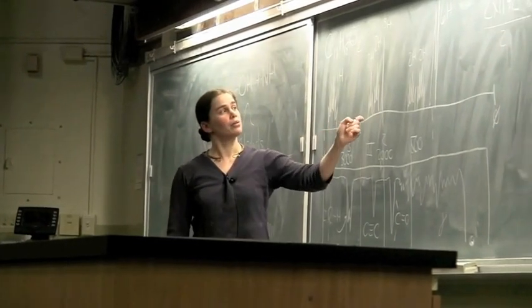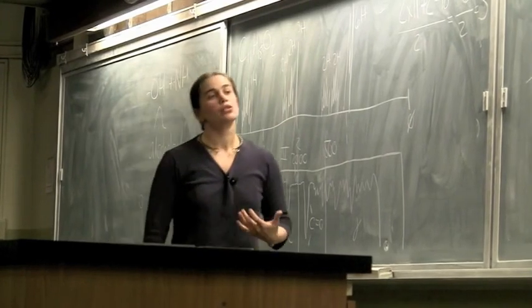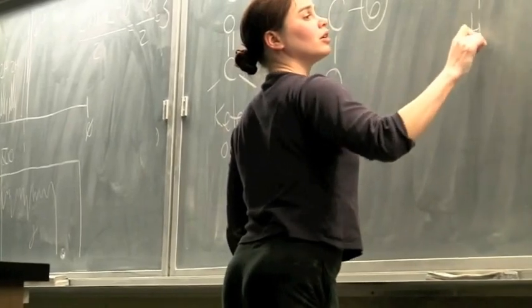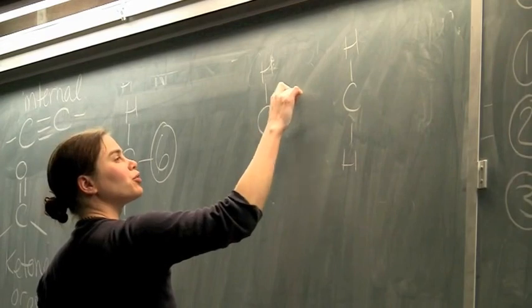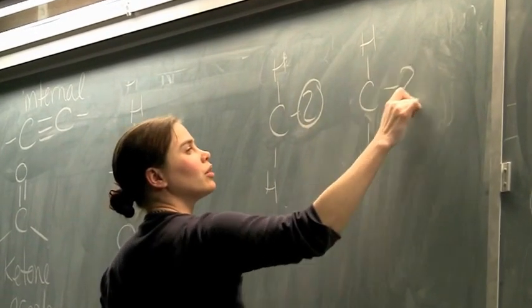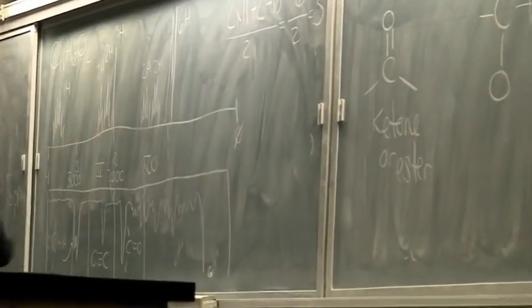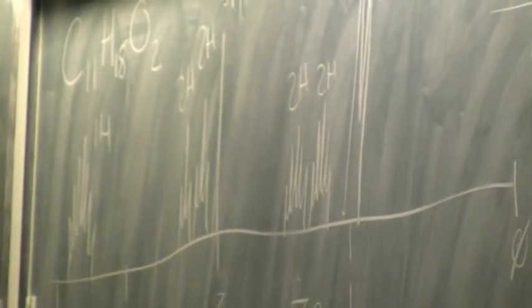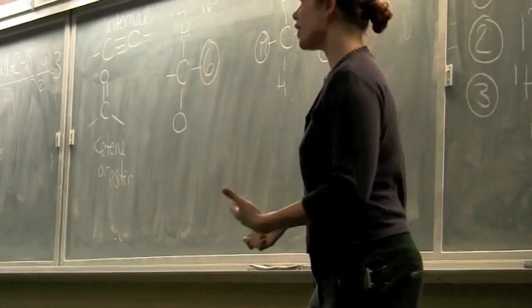So keep going. I'm going to go a little quickly here because we're getting a little short on time. I want to get to the good bits. We've got two triplets, CH2, CH2. They're both two H's. They're both triplets, meaning they have two neighbors. And they're both in that alpha to something interesting range, 2 to 2.5. Again, we don't know who's exactly next door, but you can write yourself a little note. I write a little pi bar. Sometimes I write sp2. I know there's somebody next to that that's got a pi bond. Not sure who it is yet, but there's somebody there.